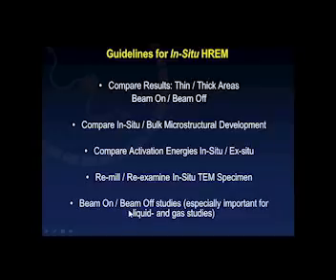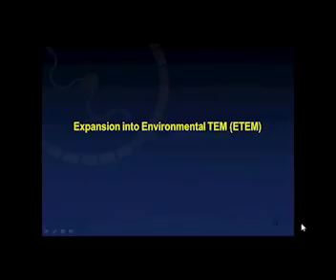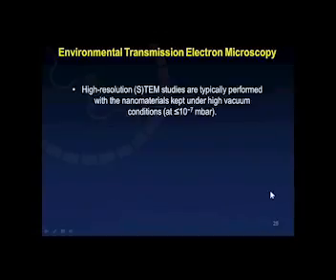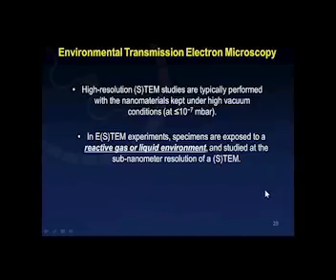And I must add at this point that the beam on and beam off studies are especially important for liquid and gas cell related studies. And this I would elaborate towards the second half of my talk. So now, moving on to environmental TEM, the in-situ TEM examples that we have looked at so far involved the examination of the specimens under high vacuum conditions, which is typically on the order of 10 to the minus 7 millibars or so. In environmental TEM experiments, the samples are exposed to a reactive gas or liquid environment and are studied at the sub-nanometer resolution of a transmission electron microscope.